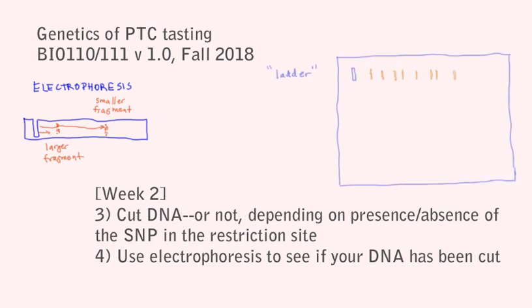The other thing we do is to put a DNA ladder into one of the wells of each gel. This contains a mixture of DNA fragments of known length, producing a known pattern in the run, and so it makes basically a ruler on the gel by which you can estimate the sizes of whatever fragments of DNA are in your gels.